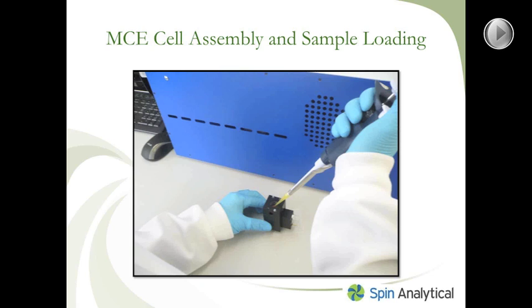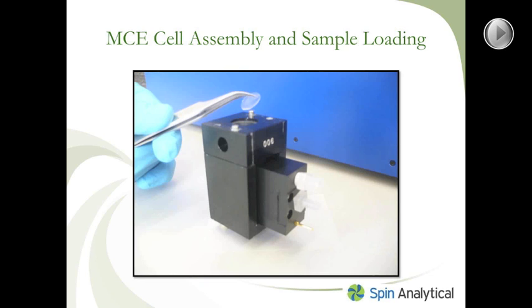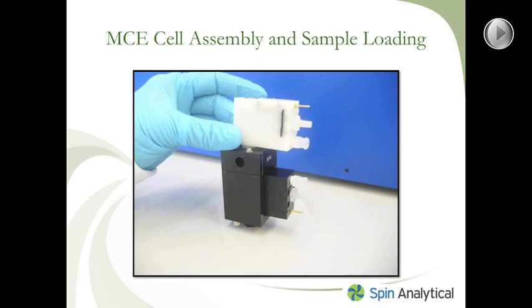The next step in the assembly procedure is to flip your half-assembled cell assembly over — before it was upside down, and now it's standing right side up. You can pipette in 20 microliters of the sample to be measured, as seen here. After you've pipetted 20 microliters of your sample, you put down your second prepared membrane, making sure that it lies flat on the cuvette. Then you take your second buffer chamber — the white buffer chamber, which is the top buffer chamber — and place the snout of it onto the cuvette well, making sure that the electrodes and ports are facing the same direction as the bottom buffer chamber.